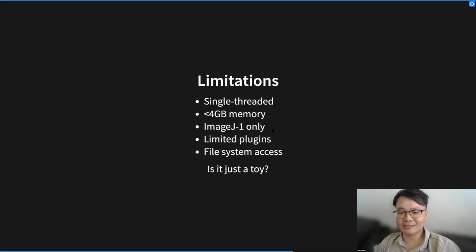And so right now, we have very limited plugins. If you want to add new plugins, you need to add them manually and compile them for each one of them, and not all of them will work. And also it only supports ImageJ 1.